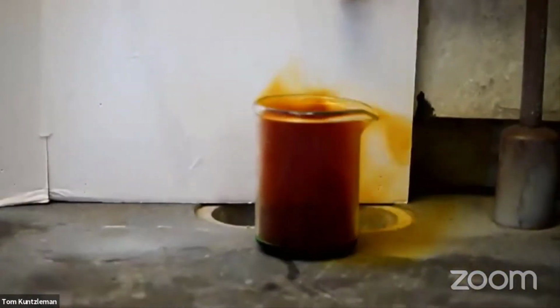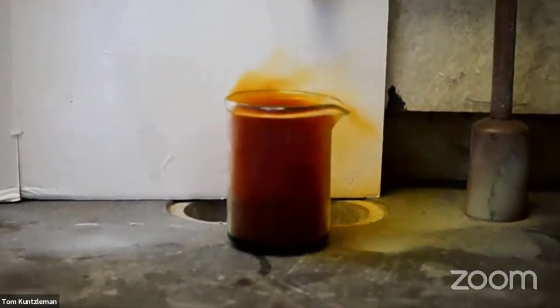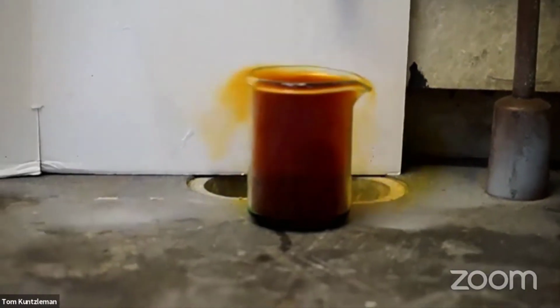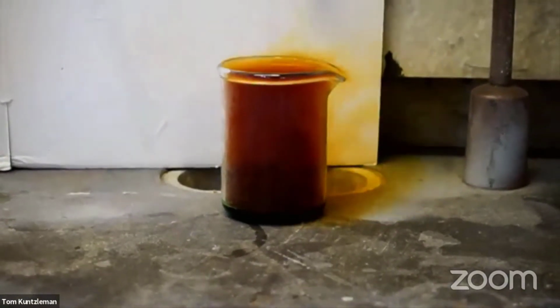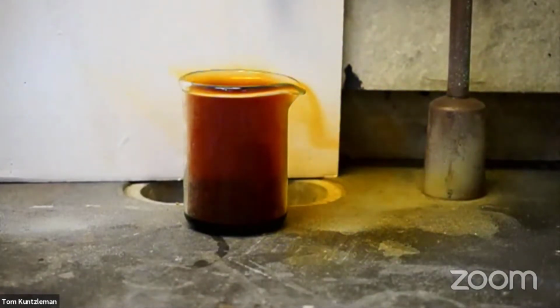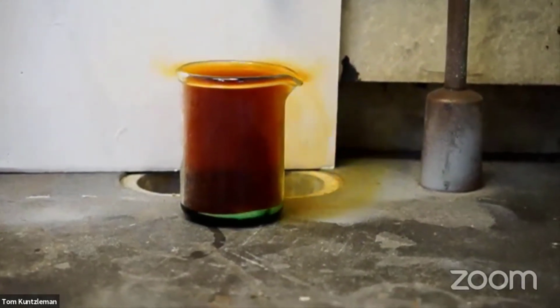So that gas is actually nitrogen dioxide. Nitrogen dioxide is the component of something that we often see when a lot of automobiles are running in the same city. You may have heard of smog before. A component of smog is nitrogen dioxide. And so sometimes when there's a lot of smog, you see sort of a brown color in the air. And that makes sense, because nitrogen dioxide, look at that, it's a brown gas. Fortunately, automobiles don't all emit that much nitrogen dioxide, or we'd be in trouble. But they do emit enough that sometimes we can see that color in the atmosphere.